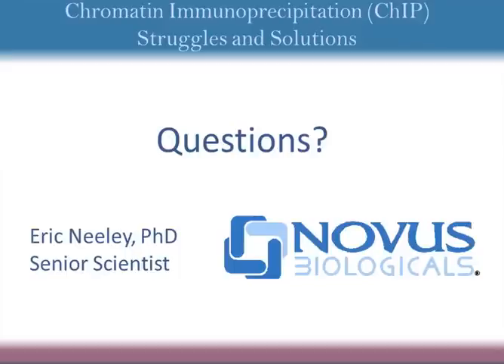I tested probably 2 to 3 times as many beads as I had data for here, and looking at the different beads under the microscope, some were perfectly spherical and worked great. Others also looked just as perfectly spherical and uniform and performed terribly. They didn't pull anything down. So I don't think it's shape. I think it probably has to do with the coating, the protein A and protein G.